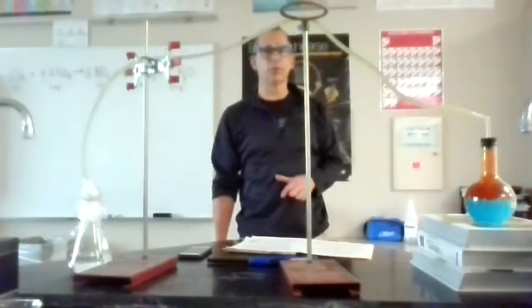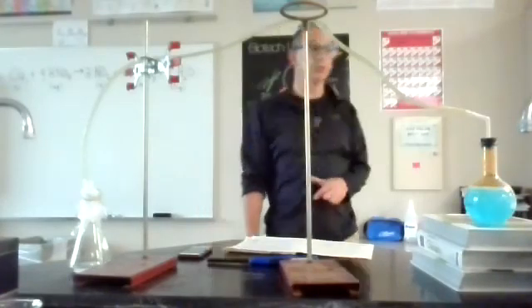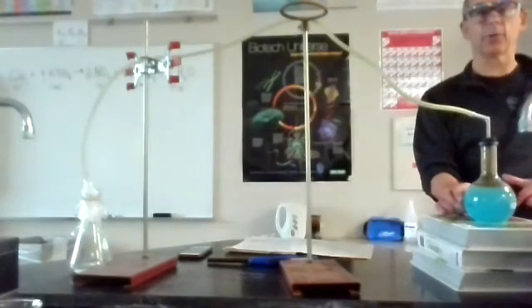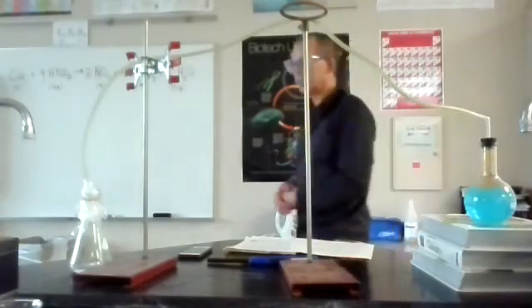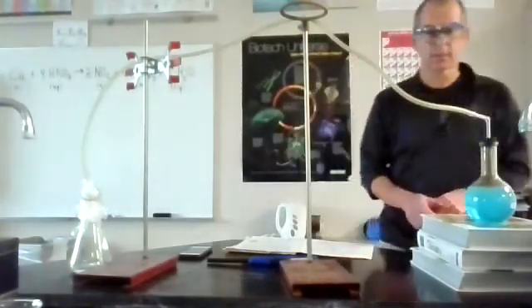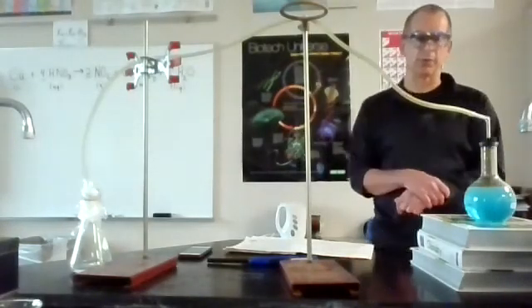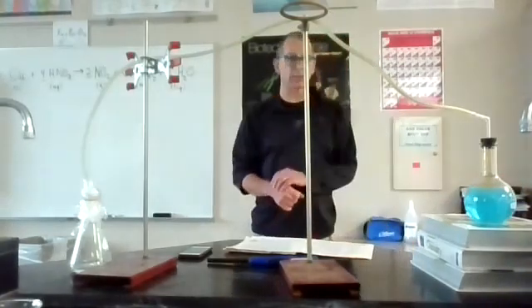Oh, look at that blue. It's the copper +2 solution. And where's my penny? It's all part of the copper +2 solution, which is the copper nitrate right there. So copper, no charge to +2, was oxidized. I think you'll find that the nitrogen in this equation is actually reduced to compensate for that. And there is our reaction for number 9.